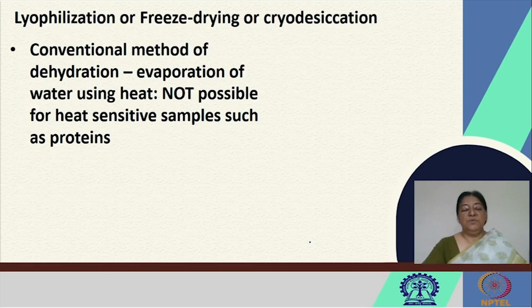When we talk about lyophilization, the idea here is that when we isolate the protein, we have our protein from the different peaks that we learned in our chromatography class, with the proteins dissolved in the buffer solution. The idea in lyophilization is to remove the water or the excess ions that we have present in the solution and retrieve the protein of interest.